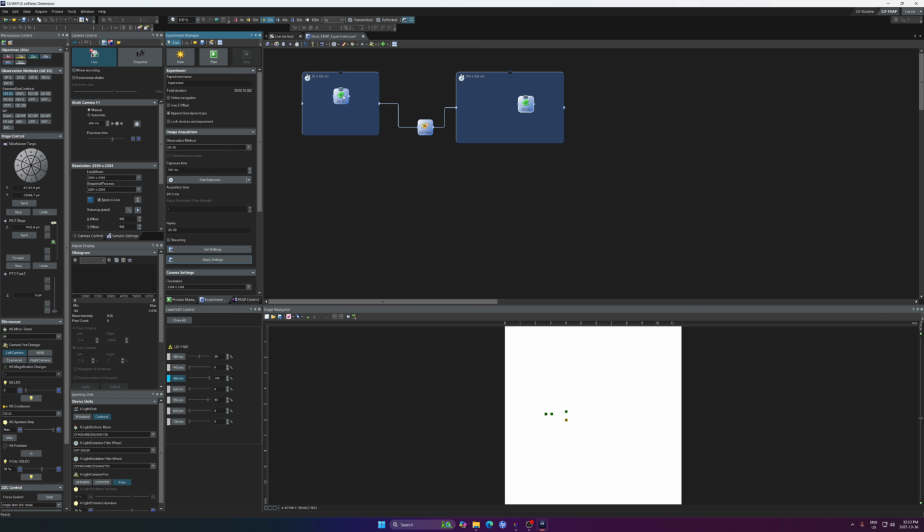I forgot. And you don't want the time to change before and after bleach. And also I changed this time lapse to shorter, 5 milliseconds. And this one I will do less, 20 time points. I will maybe do 500 milliseconds.